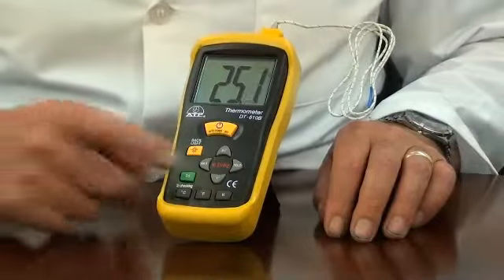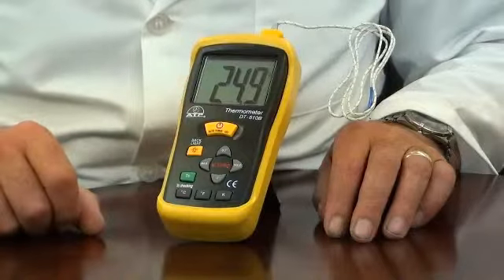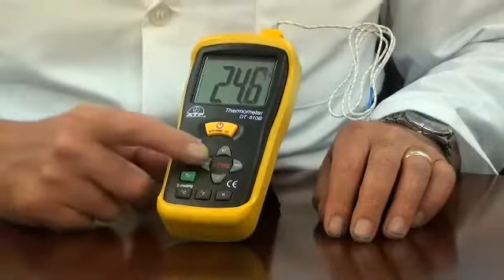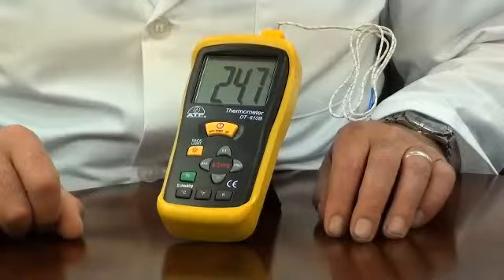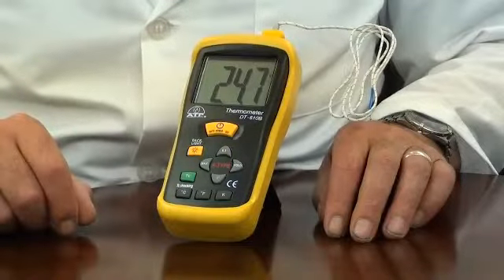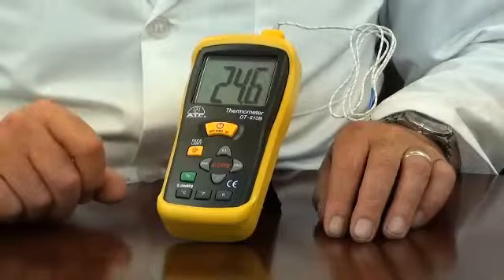The thermometer features data hold, which when pressed will hold the displayed measured value even if the probe is removed from the sample. Max hold is a feature that when varying temperature measurements are taken, the thermometer will only display and hold the highest recorded value. It also has an auto power off function and a low battery indicator.